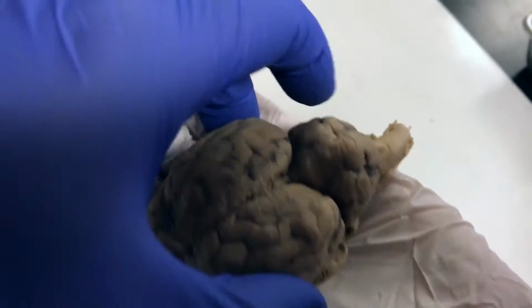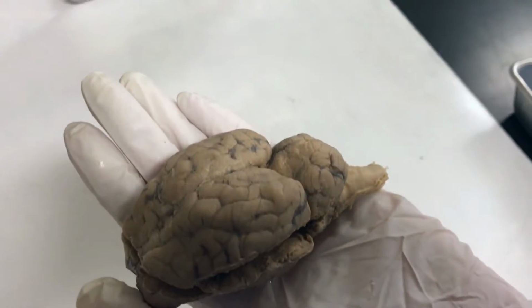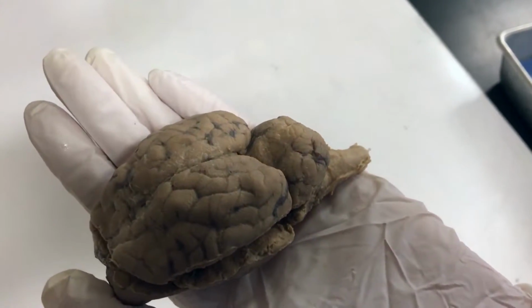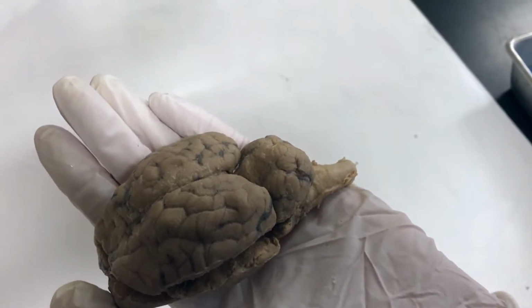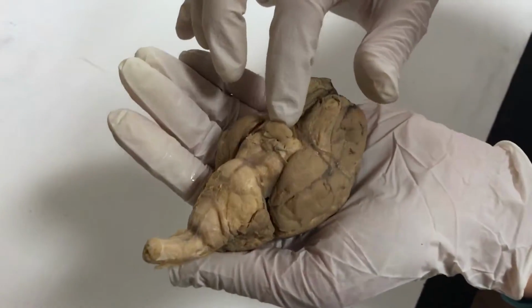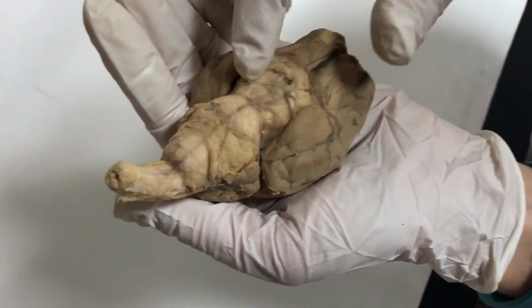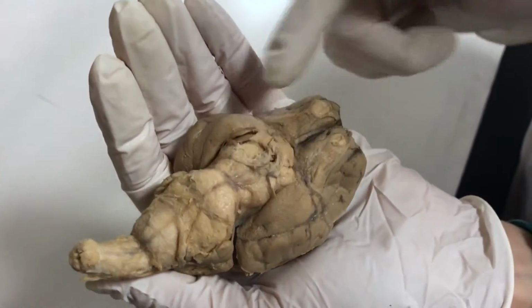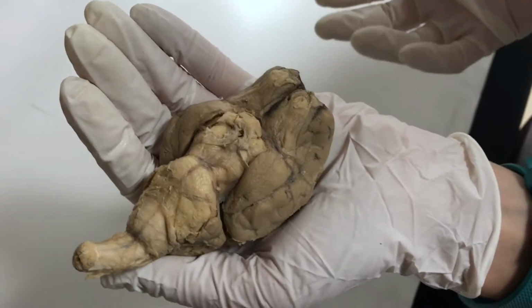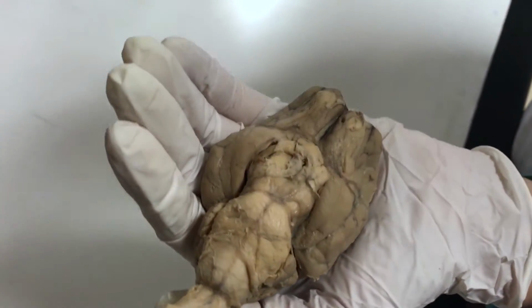And then back here is the cerebellum, which is the part of the brain that is responsible for understanding motor inputs and learning balance and things like that, hand-eye coordination, all that sort of thing. Okay, so this is the optic chiasm, and the cerebellum thing. Back behind here would be the pituitary gland, but you can't really see it right now. And these running along here are the olfactory bulbs. And then also the hypothalamus is inside, we can't see it right now.